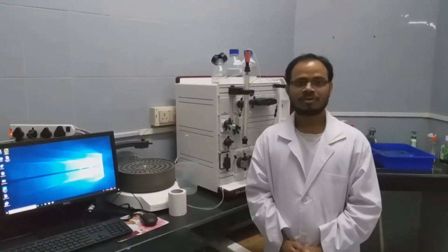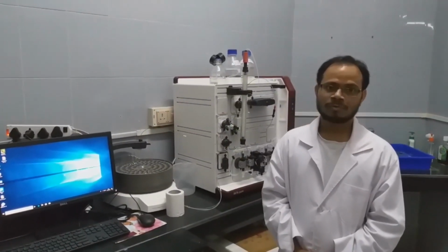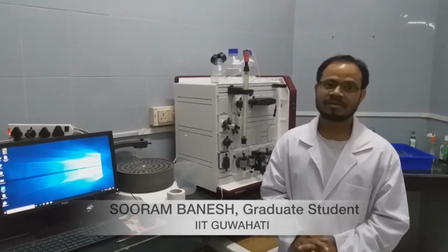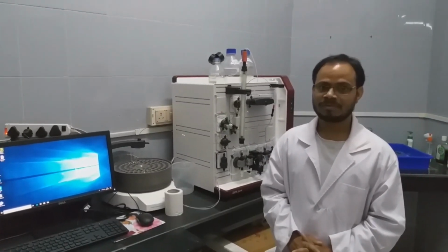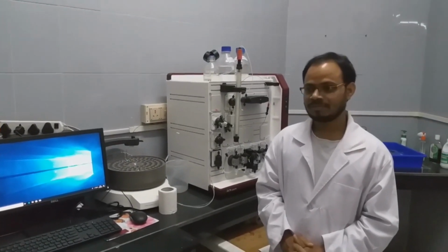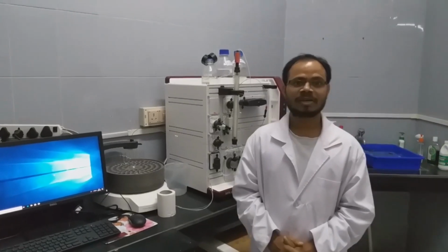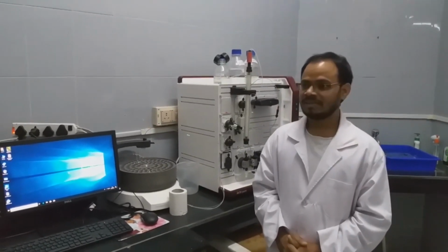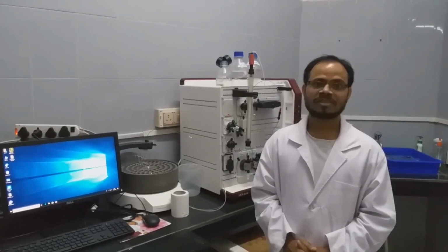In this video, we will show you how to operate an FPLC instrument and the basic principle and mechanism of how proteins are separated using FPLC. FPLC is nothing but fast protein liquid chromatography. We can say it is a derived version of HPLC.